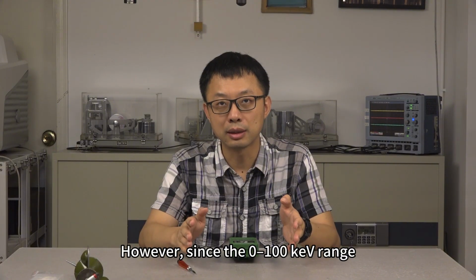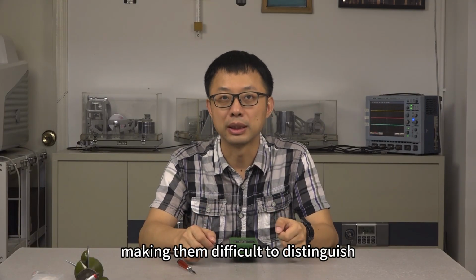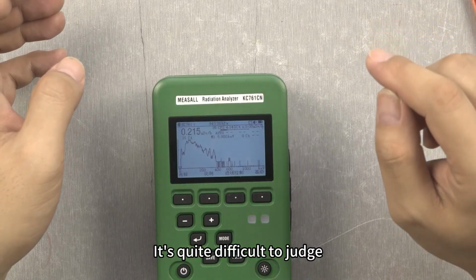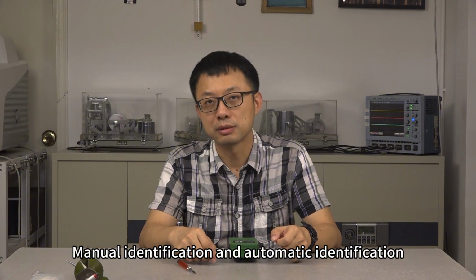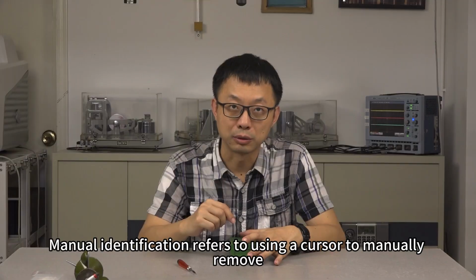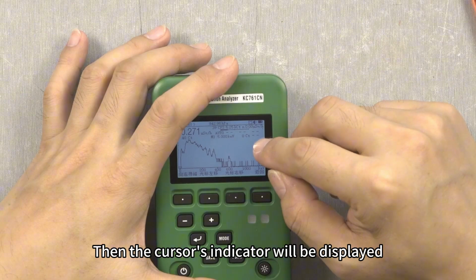However, since the 0 to 100 keV range is only this narrow band, these nuclides are densely packed within it, making them difficult to distinguish. Furthermore, some nuclides possess only a single characteristic peak. It's quite difficult to judge. The identification of isotopes on the KC761X is divided into manual identification and automatic identification. Manual identification refers to using a cursor to manually find characteristic peaks. If the cursor is at a certain position with a characteristic radiation of an isotope, then the cursor's indicator will be displayed.